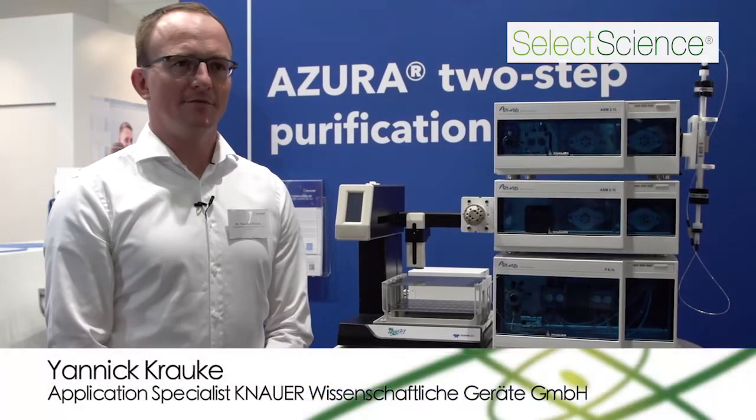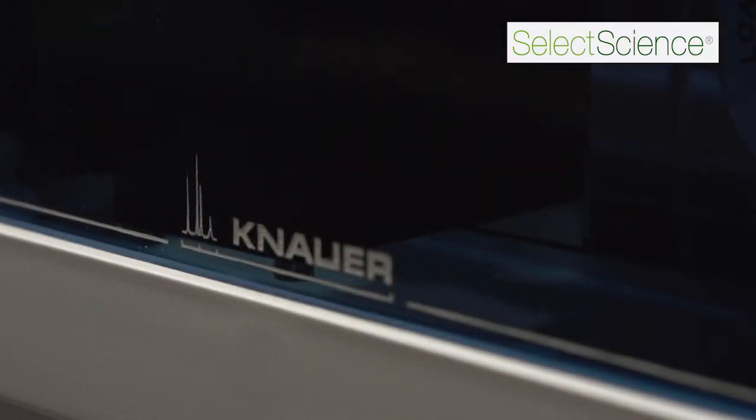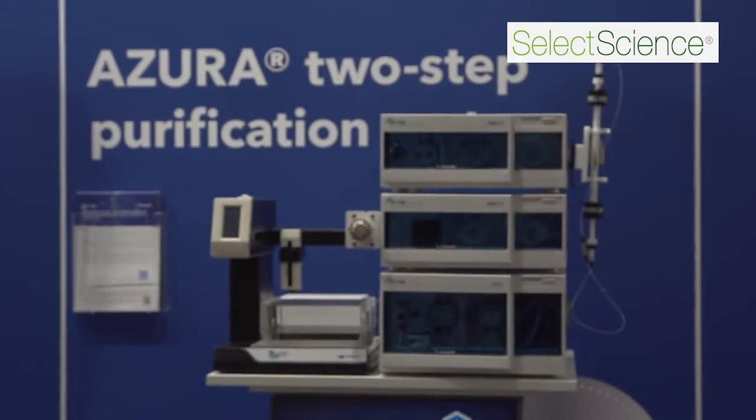My name is Janik Rauke. I'm working as application specialist at our company. Today I would like to present you the Azura two-step purification system.